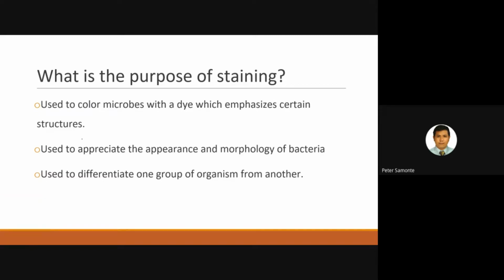Now, remember, if you recall in the previous module, I've discussed that your microorganisms, specifically your bacteria, would appear colorless. Now, if they are colorless, you would have a hard time identifying them. But with the addition of a stain, you would learn to appreciate the appearance and the morphology of your bacteria. There would be easier identification, class. Easier identification of your microorganisms.